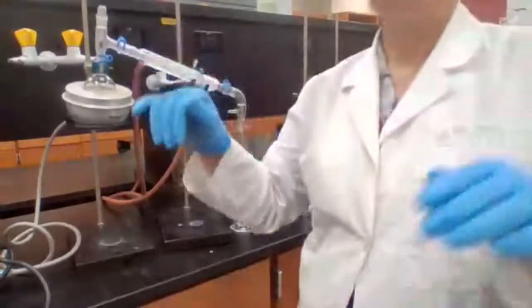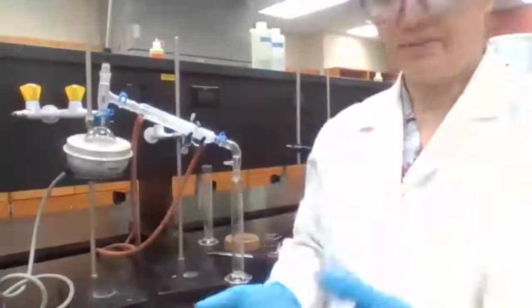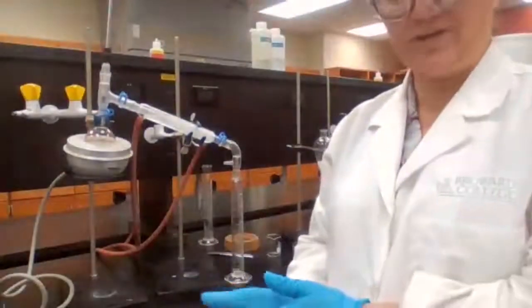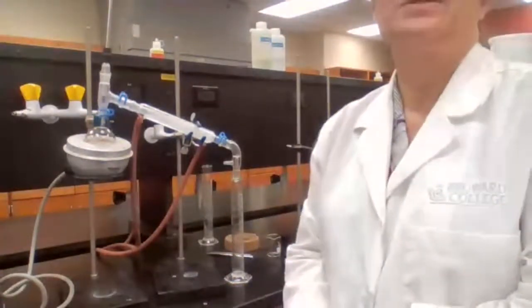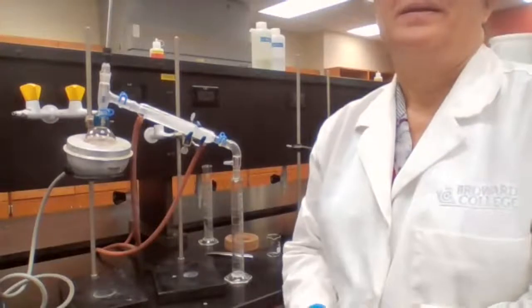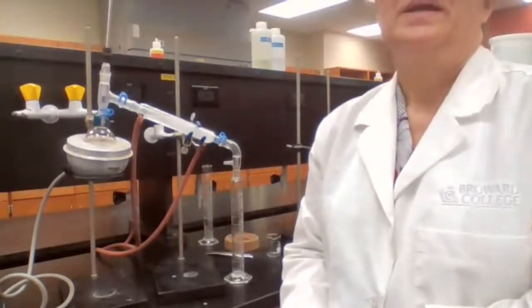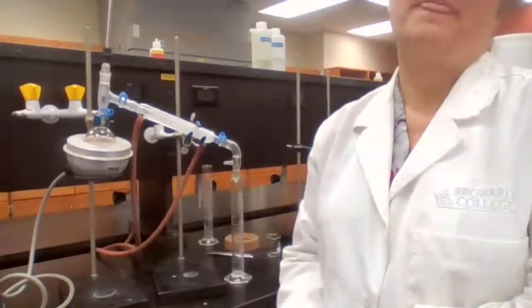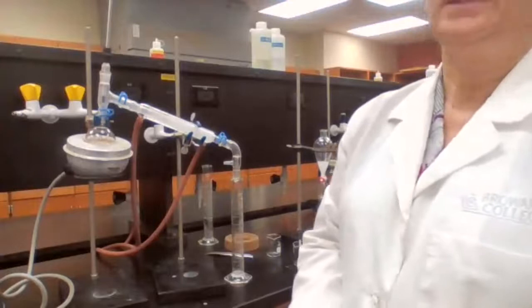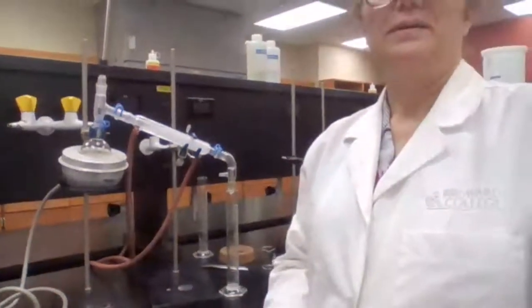Can you tell me what type of distillation we are doing now? Is this actually simple distillation, fractional distillation, steam distillation, or vacuum distillation? What type of distillation is taking place here? A simple distillation. The setup is a simple distillation. But what is actually done here is not simple distillation.